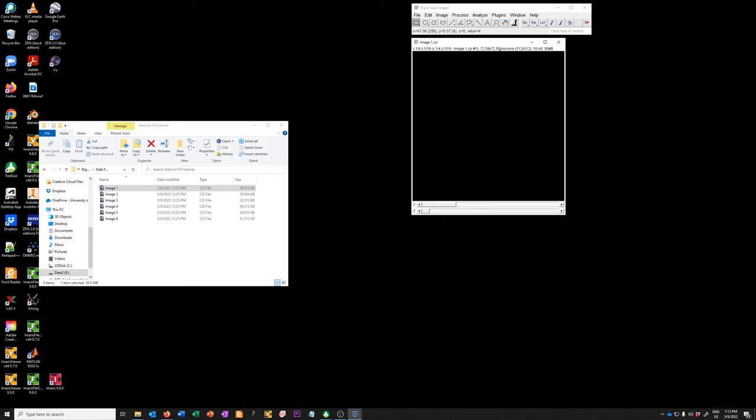Over in areas where there's really nothing, there's a little speckling and noise from the detector. If we're sure there's no biological material there, we can increase the minimum so that area goes completely dark. We don't want to go too far because then we'll be chopping off real signal inside the nuclei, but increasing it just a little from zero — telling the software that intensities at 26 or below should be the darkest color — and scaling linearly from 26 up to the maximum, gives us a nicer result.